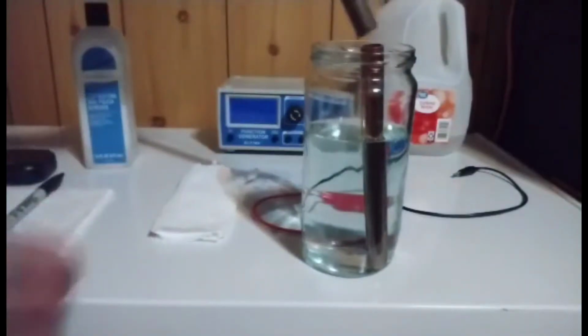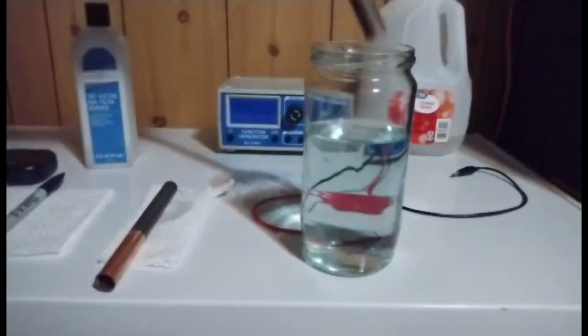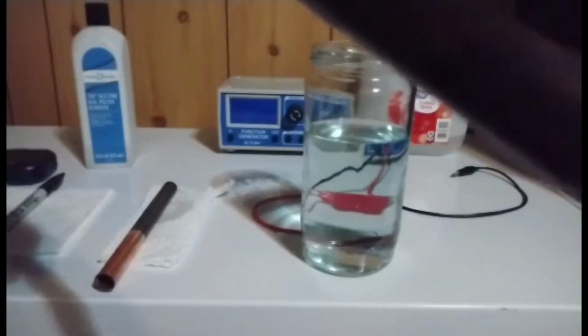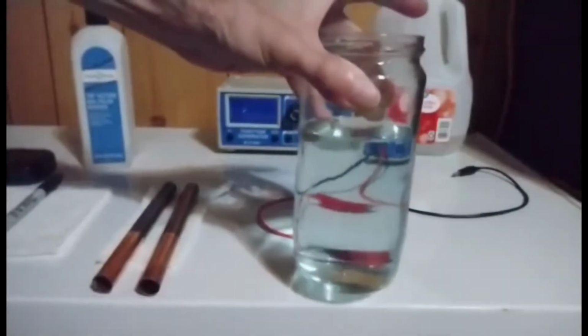This is the anode. You can see that it has been corroded and it will have to be cleaned because we're going to use it again. So I will scrub it with some steel wool. And here the cathode. Well, I don't know if it's been corroded. In principle, it has been coated with something. So, well, anyway, it has to be cleaned too, because we don't want any impurities in the solution. The solution is pretty clear, so I believe that there are not too many impurities in there.